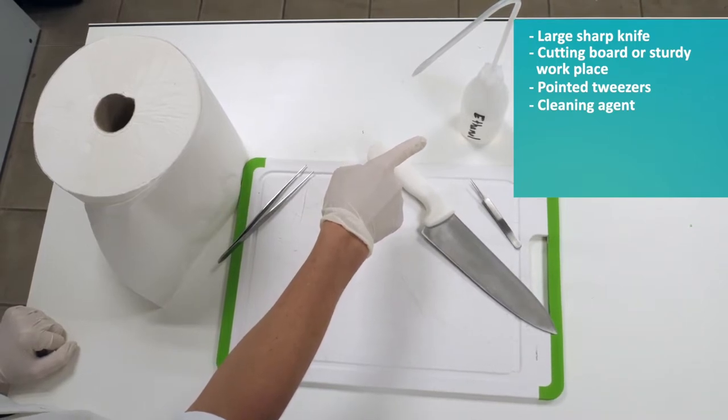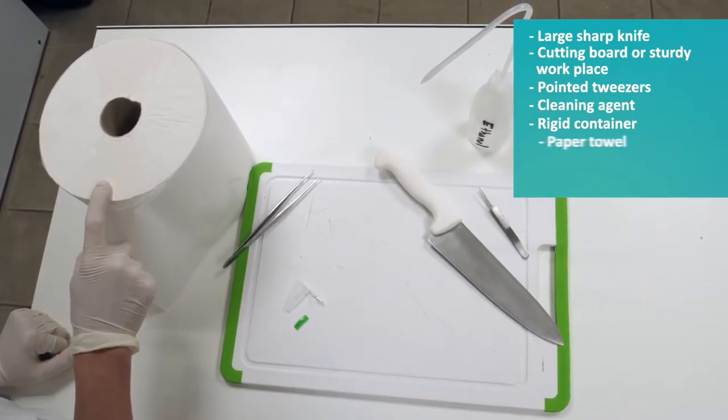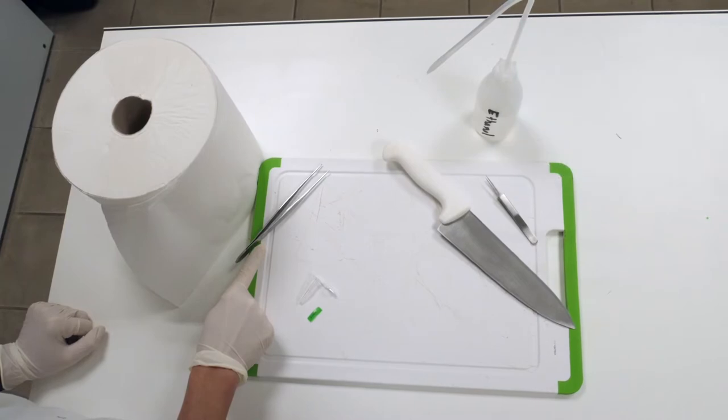You will also need water with a little bleach or just water, a container that is preferably rigid — particularly for fragile otoliths — paper towel, an identification tag, and a sturdy pair of tweezers or forceps for certain fish species.